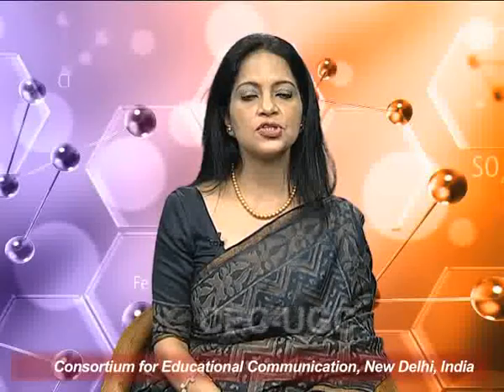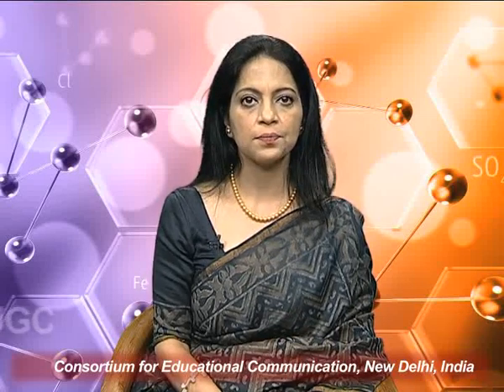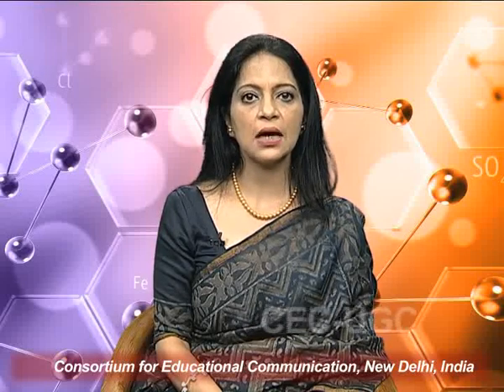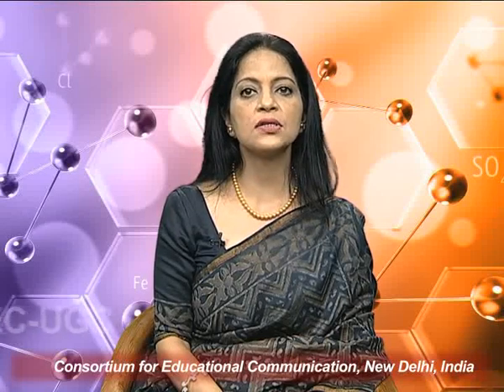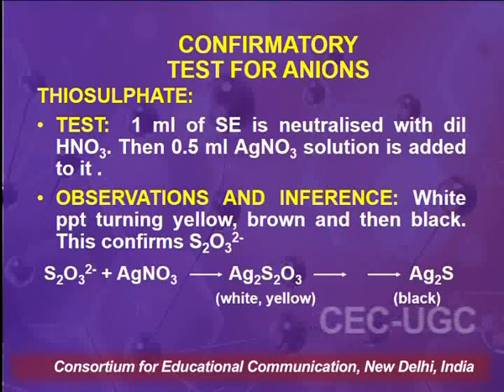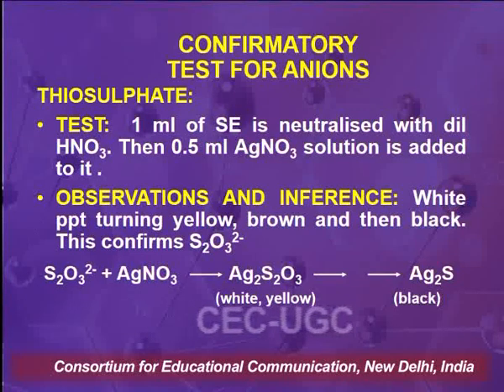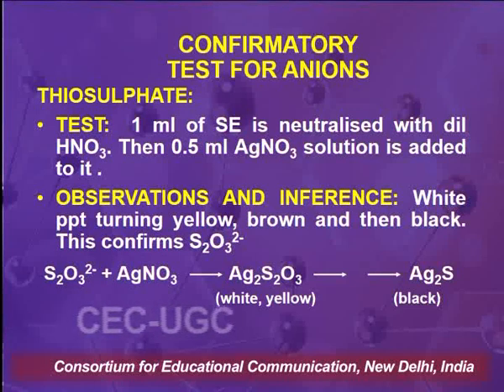The next ion which needs to be detected following a systematic analysis is thiosulfate. So to 1 ml of soda extract, dilute nitric acid is added to neutralize it, and then 0.5 ml of silver nitrate solution is added. Again, as we can see, the nitrate ion is common to silver nitrate and nitric acid. So the acid chosen to neutralize the soda extract has a common ion with the reagent further added, termed the precipitating reagent.